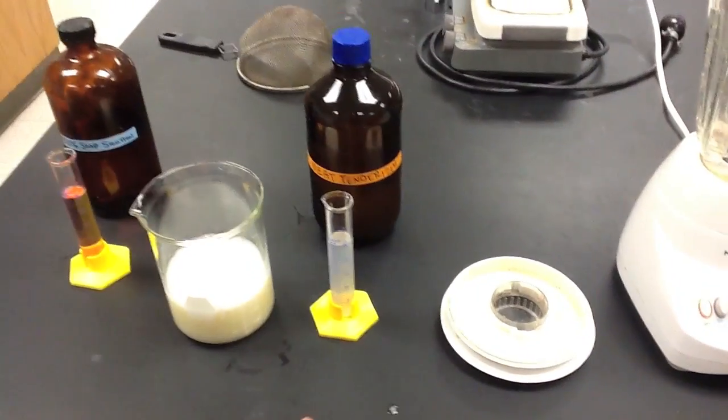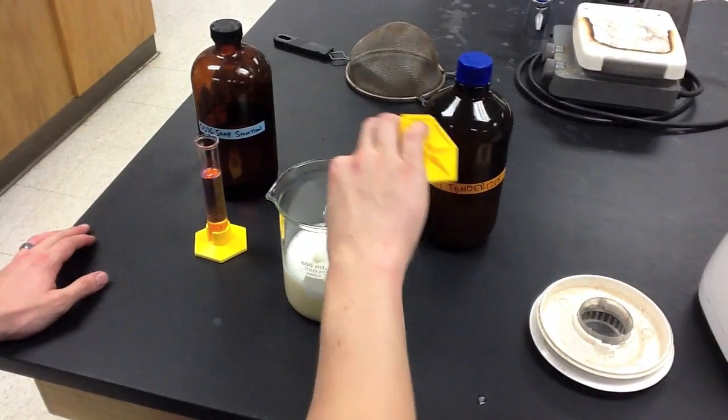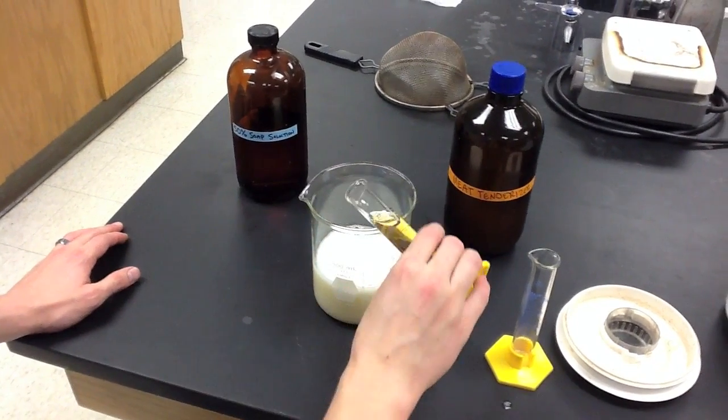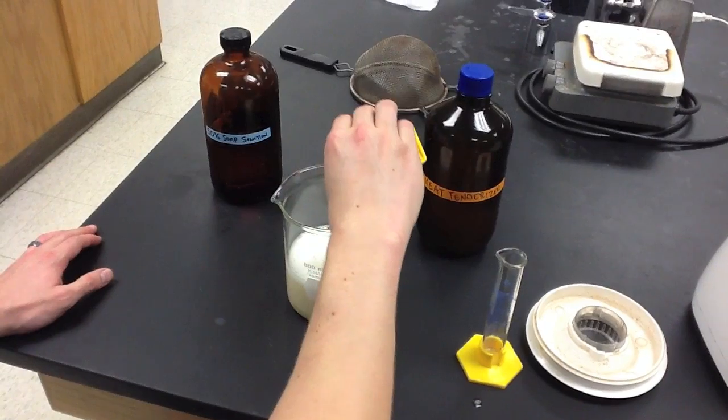Once we had successfully blended the banana, we then added 25 milliliters of meat tenderizer solution and 25 milliliters of 50% soap solution to the mixture.